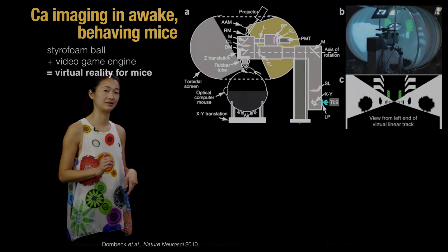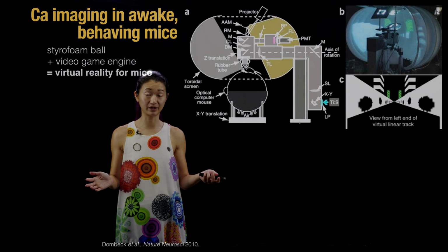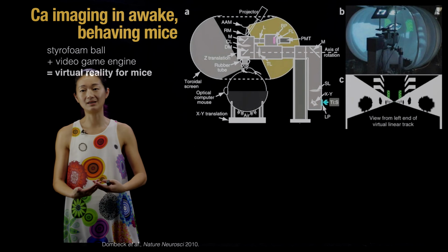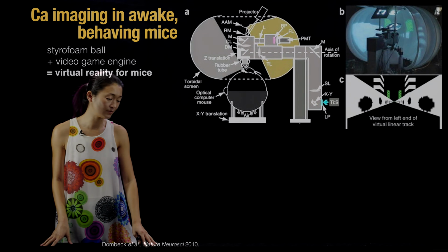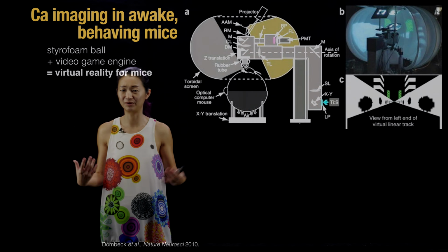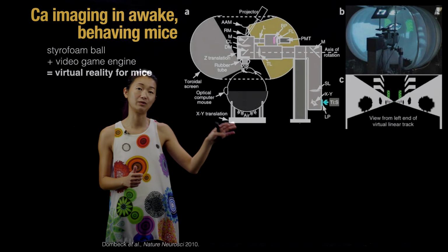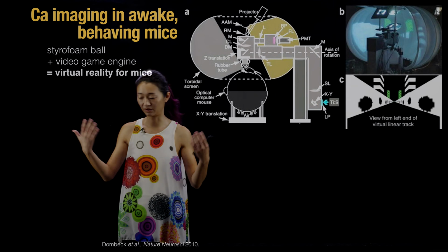We could also take advantage of this to do calcium imaging in awake and behaving mice. This is a technology that is possible with electrical recordings as well. We know how to do this where you put a head stage that's implanted inside, that's sticking out of the animal's head, and the animal can either be sitting in a chair and behaving, or they can be running around in an arena and behaving. If they need to be attached with wires, sometimes you have to build a special set of wire management systems so they don't tangle themselves up or chew through the wires. It is now possible to do wireless recordings as well, and there are also wireless microscopes that have been developed, so you can do calcium imaging in awake behaving mice, not head fixed either. You can actually have a microscope that kind of runs around with the mouse.